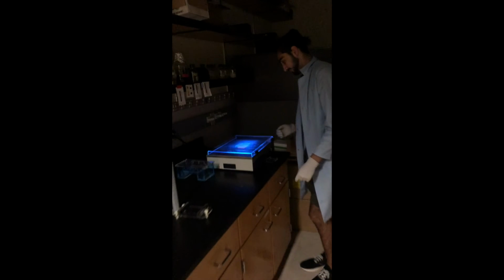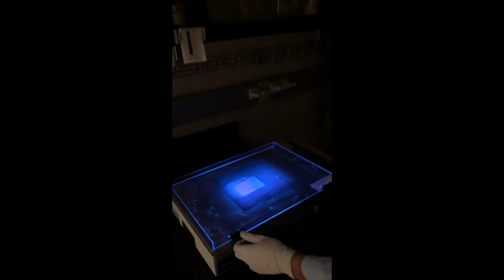Lights. Camera. Action. Now, as you can see under the UV hood, you'll be able to see what ran and didn't run on your gel. And in our case, nothing ran except the ladders, which is fantastic. But that is how you do gel electrophoresis.